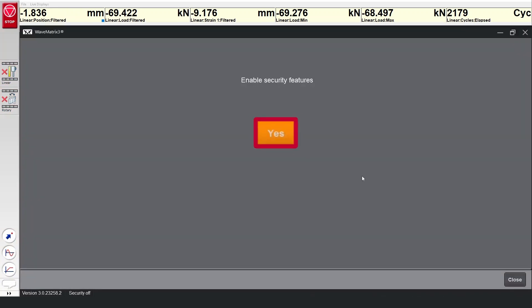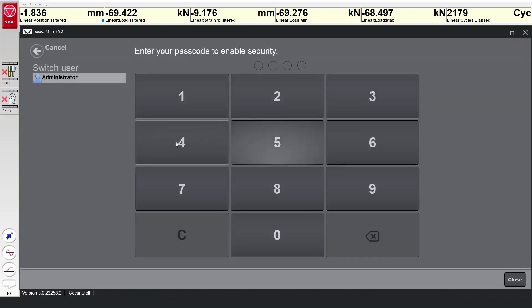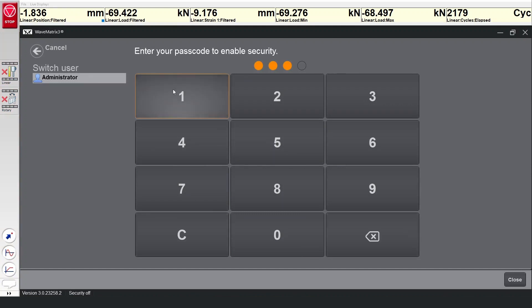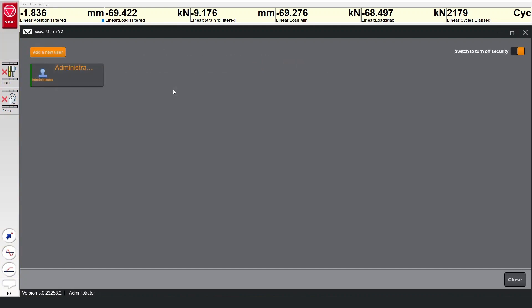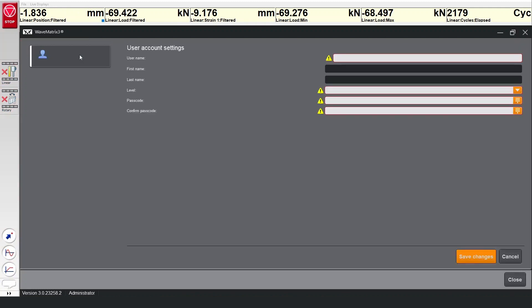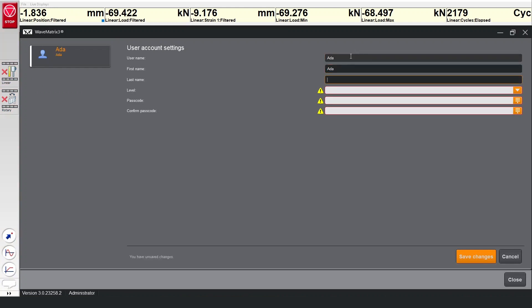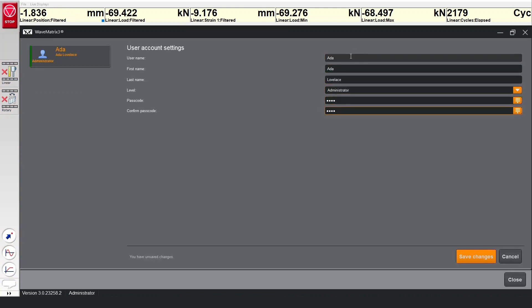If this is the first time that it has been used, then an administrator account must be set up first, but after that an existing administrator will be required to log in. Other user profiles can be created by the administrator, and those individual users will be able to update their own details and pin codes if they wish.